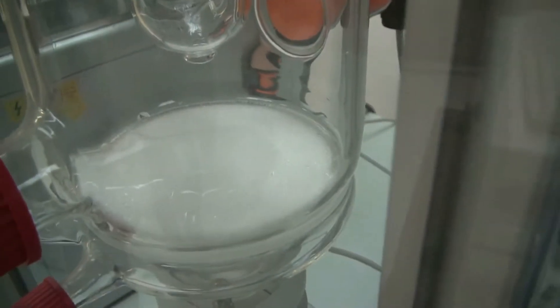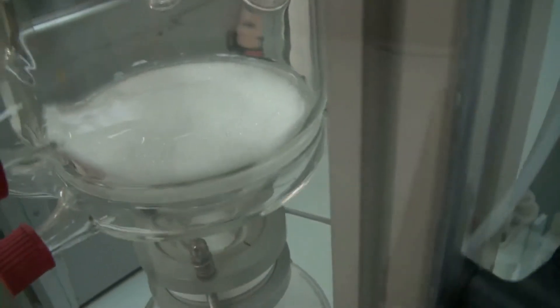It drips down all the way to the bottom here and then it actually filters. There's actually some water laying on top of the filter. It filters it somewhat and then it comes into the bottom glassware here, clear down to the bottom where you see the hose coming out.